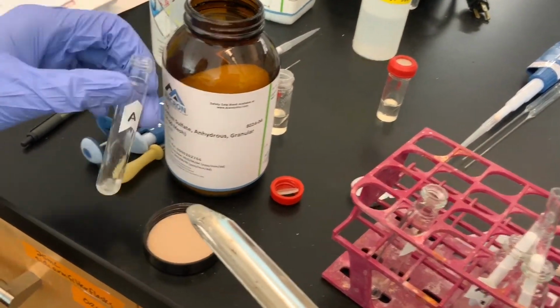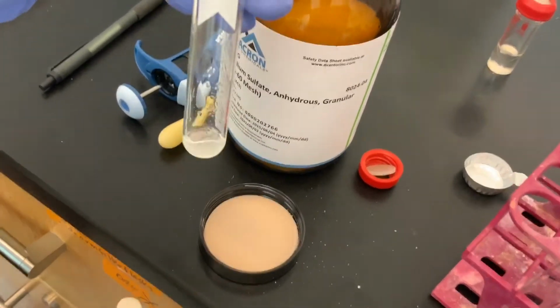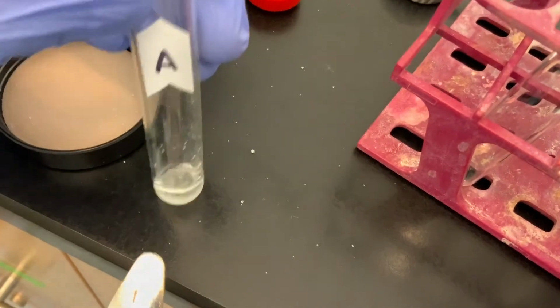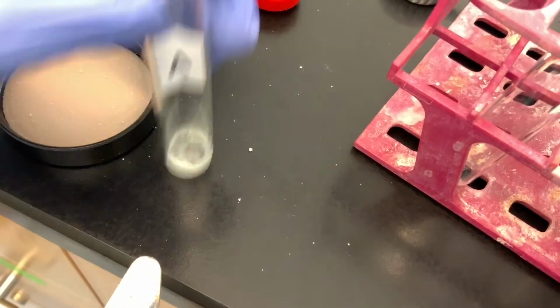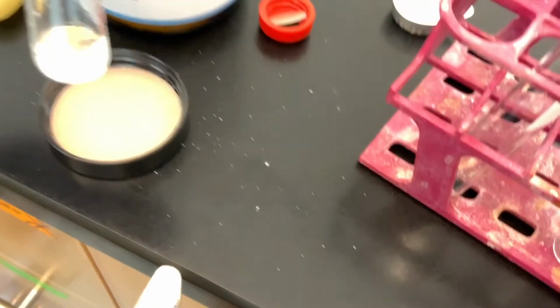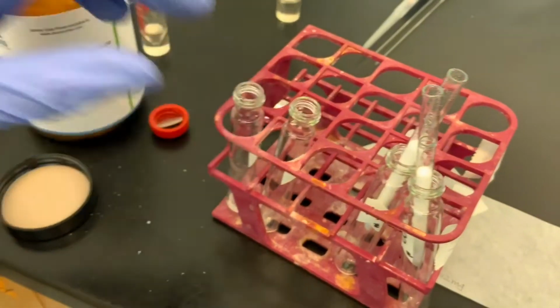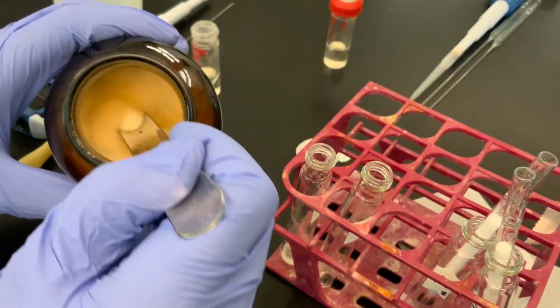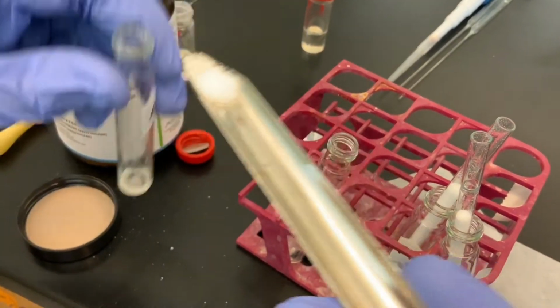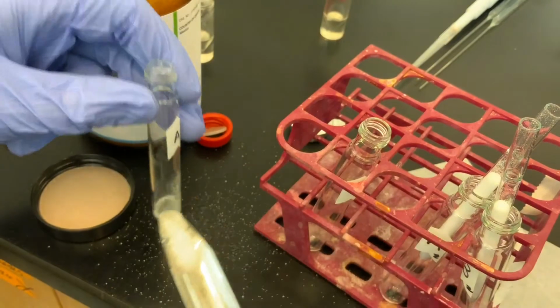Organic chemists are messy. And we see that some is stuck to the bottom here. That's a good indicator that we need a little bit more, because we want some free-flowing sodium sulfate, what we've referred to as the snow globe effect. Really messy today.